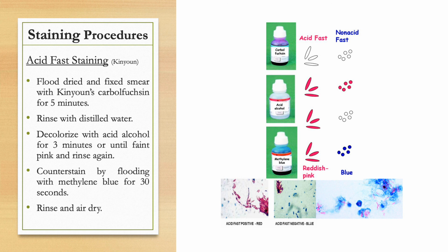After, you rinse with distilled water and decolorize with acid alcohol for 3 minutes until faint pink, and then you rinse again with tap water. After you do that, you can counterstain by flooding with methylene blue for 30 seconds. And then you rinse and dry your slide before viewing it under the microscope.